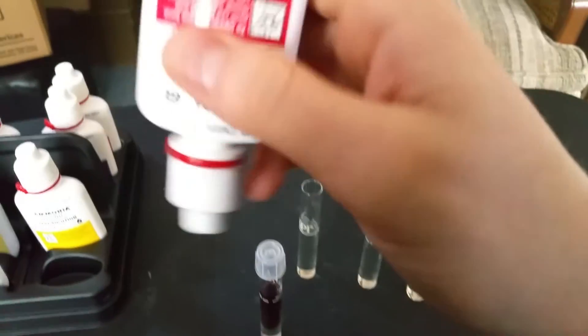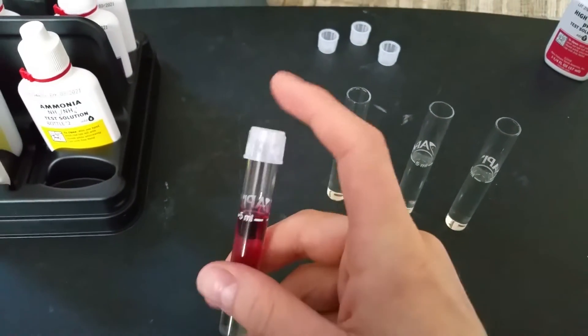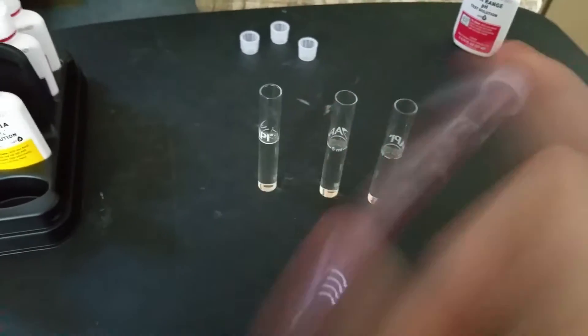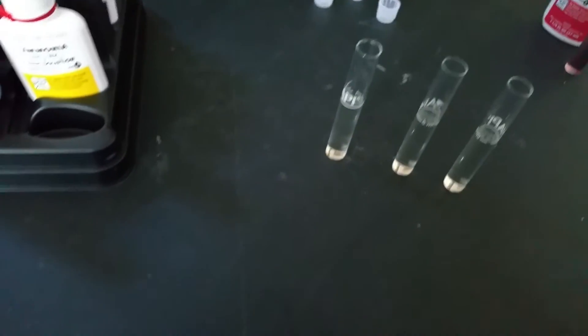Hold the bottle straight down and put in 5 drops — that way each drop is more uniform. Then put the cap on, and for high range pH just give it a few shakes for a couple of seconds. I usually like to put the tubes right next to their bottle so I do not forget which one is which.